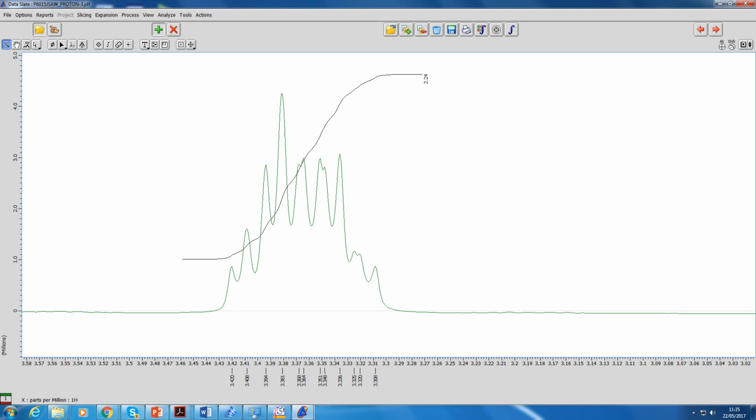Now if you go to threshold, it's the 7th button. It gives you the black line and the line slightly above that, that's for noise. So you can, if you want, adjust that line as well. That sounds useful. You might not want to. We get out by going home, and that takes us right back out.